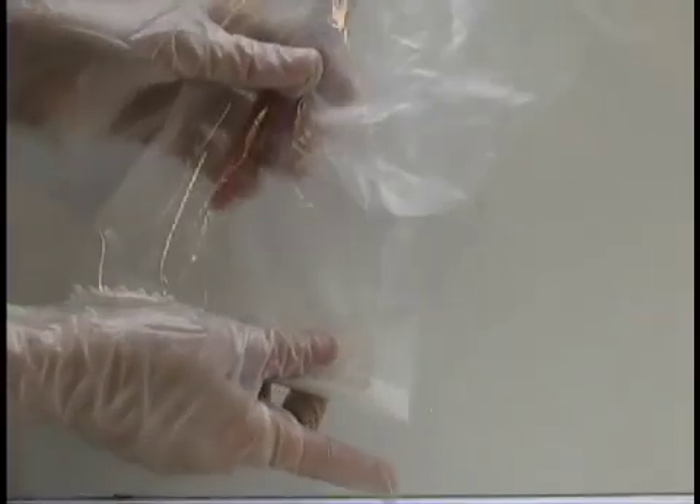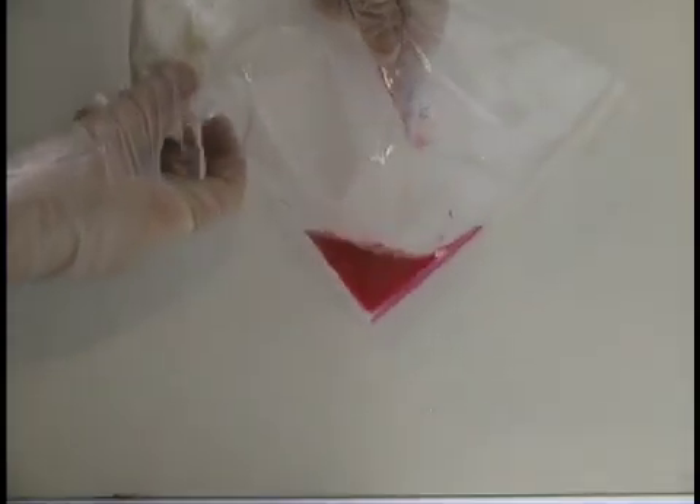Then, turn the bag over to spill out the phenol red, and upright again to mix it with the solids.